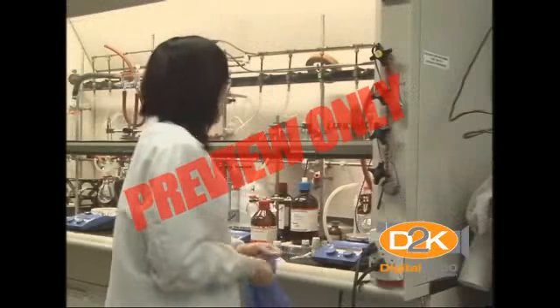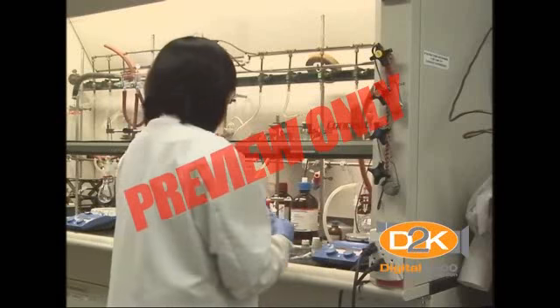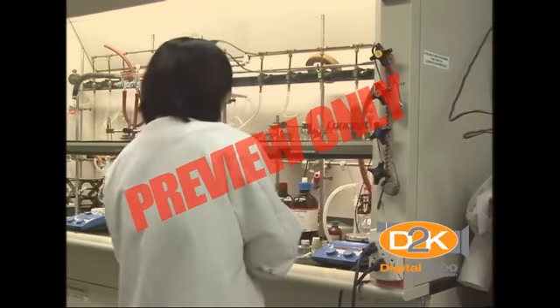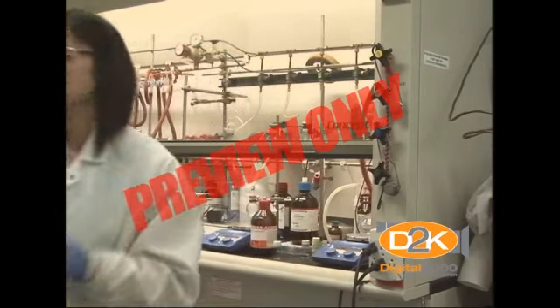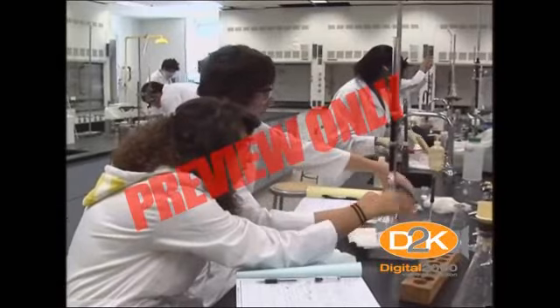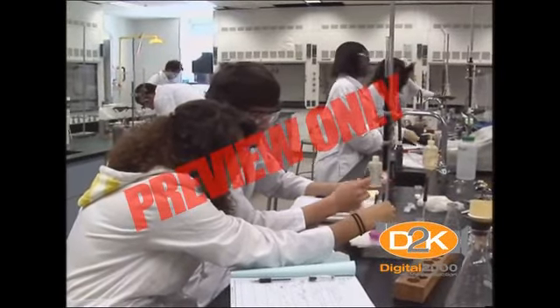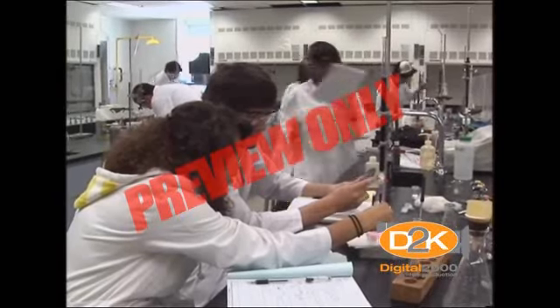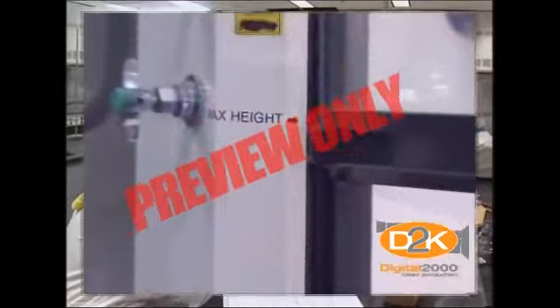A well-designed fume hood, when properly installed and maintained, offers a substantial degree of protection to the student and professor, provided that it is used correctly and its limitations are understood. Fume hood sashes should always be maintained in the closed position when not in use. The amount of energy used by one fume hood is equivalent to the energy used by 3 average households.